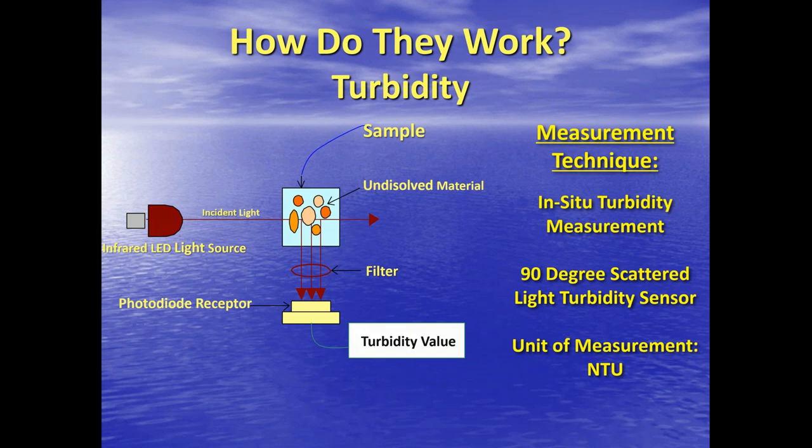So the way that the turbidimeter works, the ultrasonic works exactly the same as previously, but you've got one lens where you've got a light generator or a light source, and that's an infrared LED, and then you've got a light receptor under the other lens. And the idea is, if you have stuff in the water, it's going to reflect light and you'll be able to pick that up. And then we scale or calibrate it to 0 to 50 NTU. So it's just that simple. If, for example, that sensor was out of the water, the turbidimeter continues to work, but there's nothing in the air. So we usually measure zero turbidity when the sensor's in air.